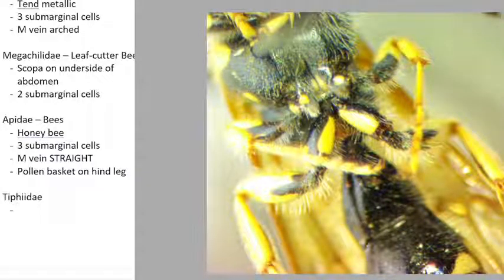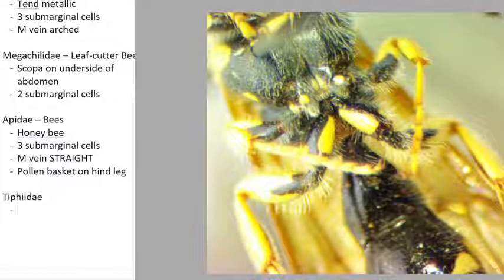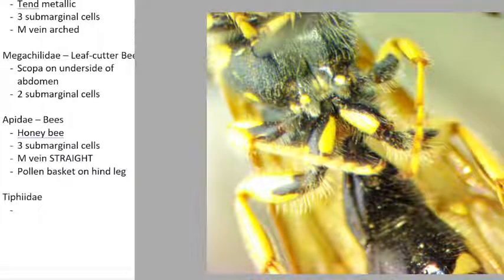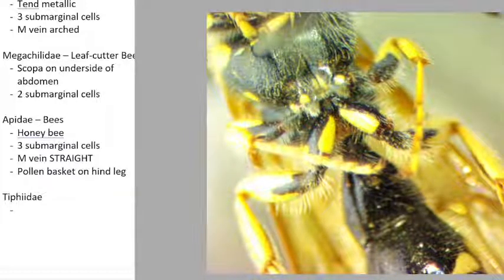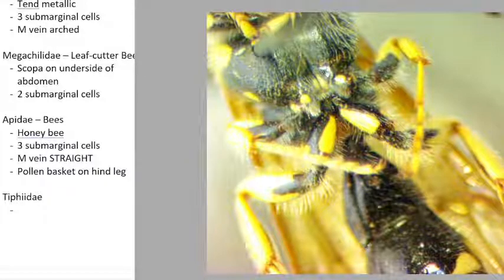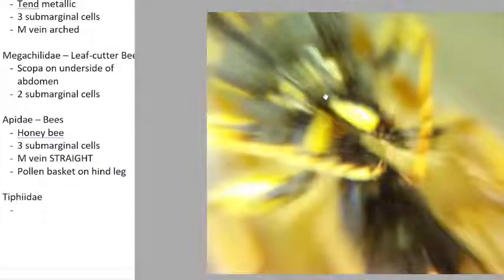Right here. So, how do I describe what I'm seeing? They're triangular. Mid-coxy. Okay. I think we got this. All right. So right about here, we have these triangular projections between the middle legs, right? So you can see right here we have one kind of triangular projection, and here we have another one, and they kind of project down in between the middle legs.